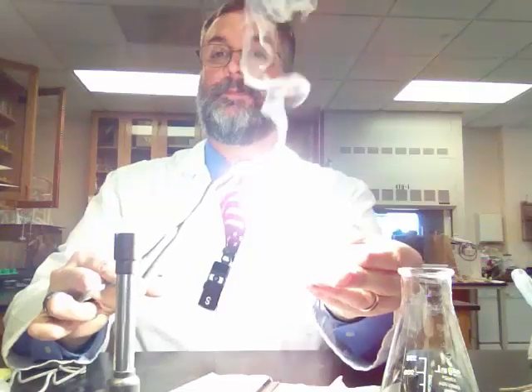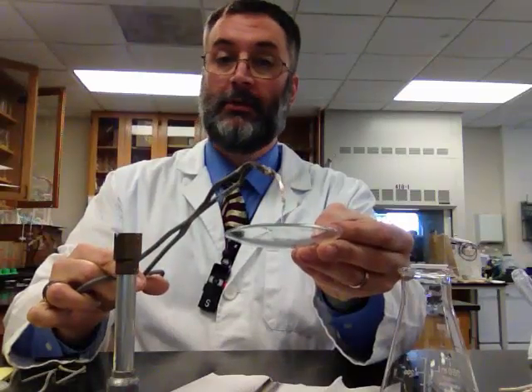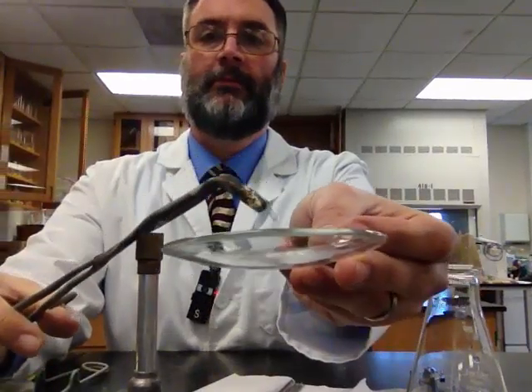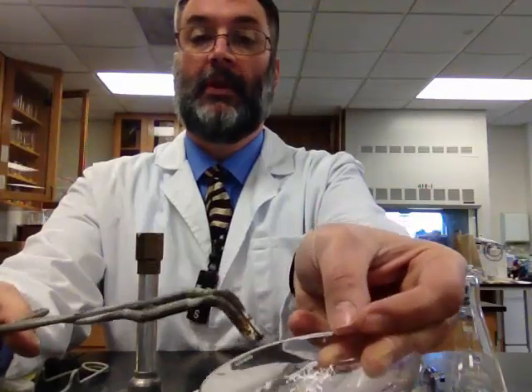Okay? It's a very, very bright light. Some smoke produced. And what's left over at the end sort of crumbles. Not malleable at all. Definitely not shiny.